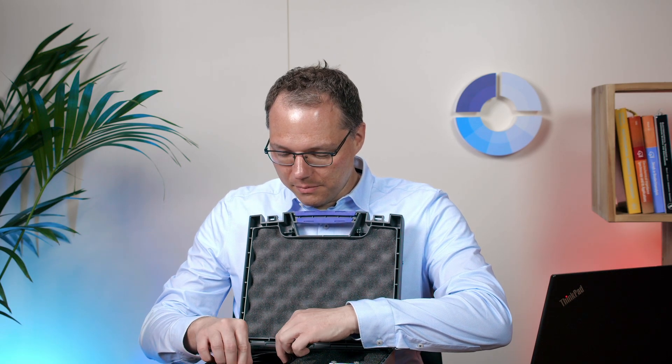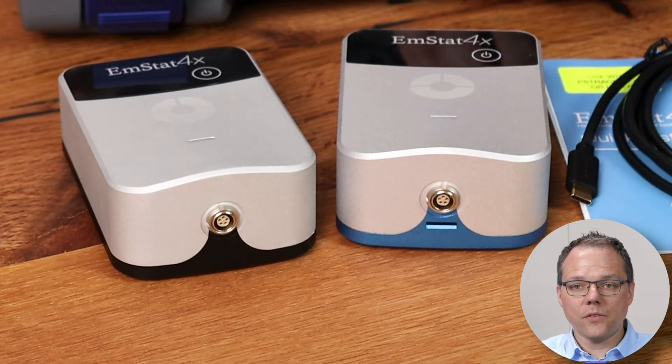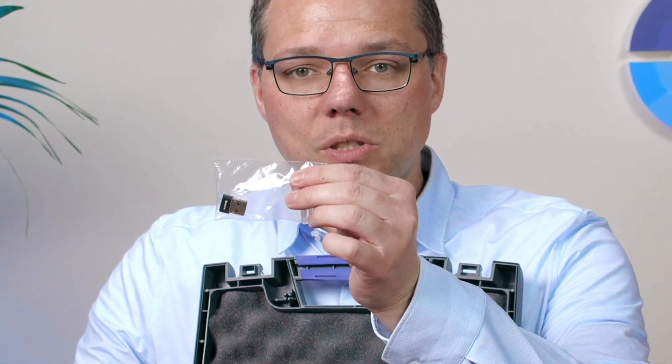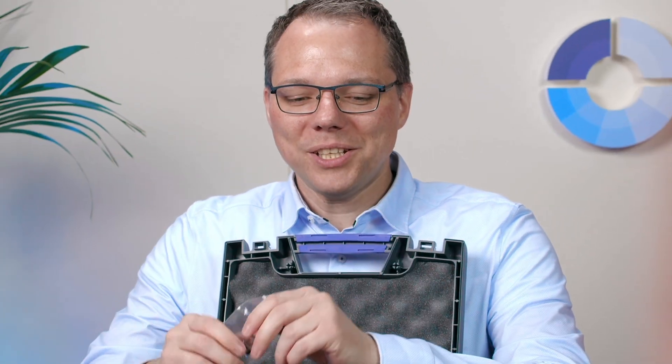What else is in the box? There's a USB-C cable — it's USB-C to USB-C — and if your computer does not have a USB-C port, don't worry, we've also included a little adapter to USB-A, which is the standard USB.